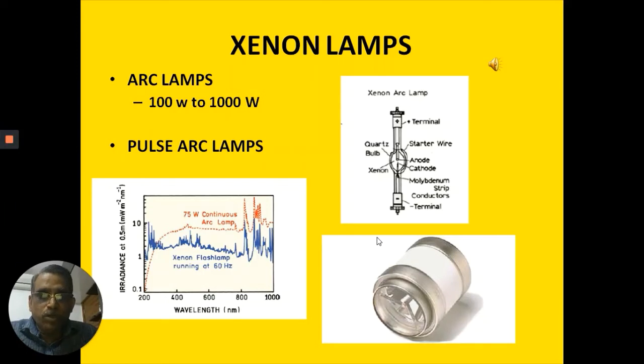So you have to be cautious. You should not expose your bare eyes to the xenon lamps. They will kill your eyesight. They will damage it otherwise. So it is important, you must have proper protective glasses when you see any intense lights. Even if you look at the sunlight for some time, you may feel like becoming blind. It will take some time for you to look at things normally, because the intensity is quite high. So anything that is more intense you should not see with your bare eye. This is the first principle, you should realize it.